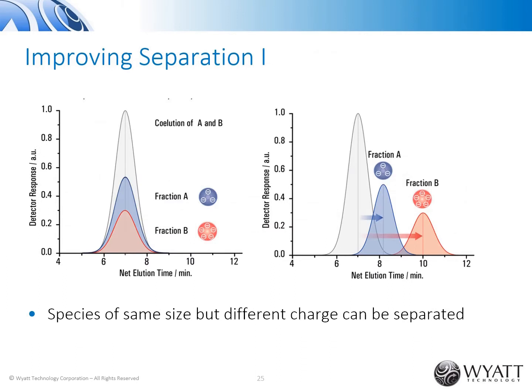If we choose the polarity of the field such that we have an attractive force towards the accumulation wall, that is, a negative charge on the particle and a positive charge on the accumulation wall, then the retention time will increase, proportional to the electrical field strength.